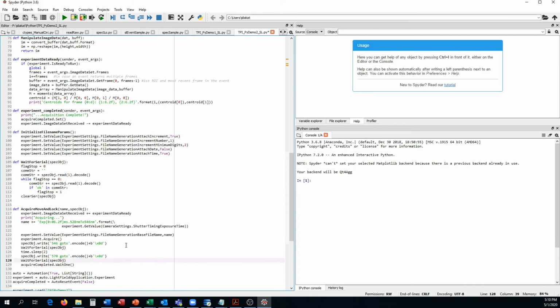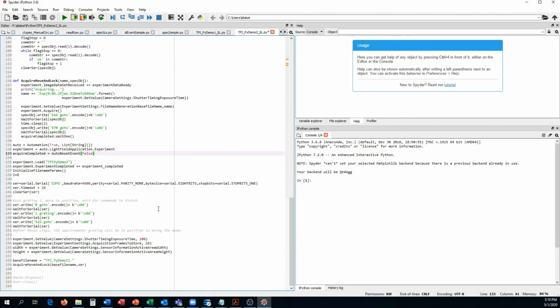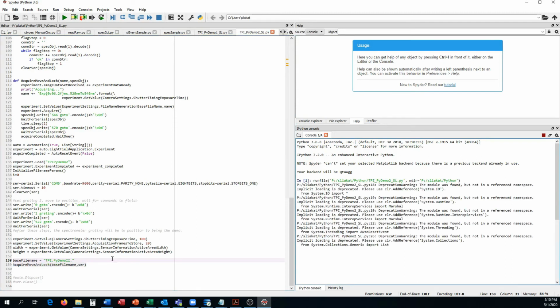Now that we've walked through the script, let's run this. I'm going to press F5 to run this, and it's going to open up that add-in process. You're going to want to pay attention to this console here, as it's going to update every frame.